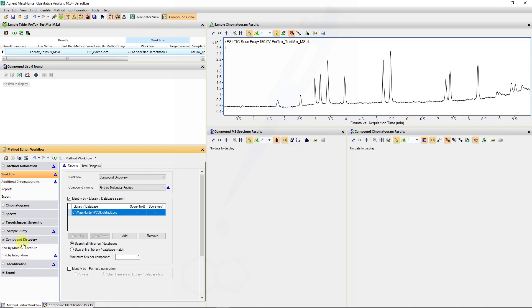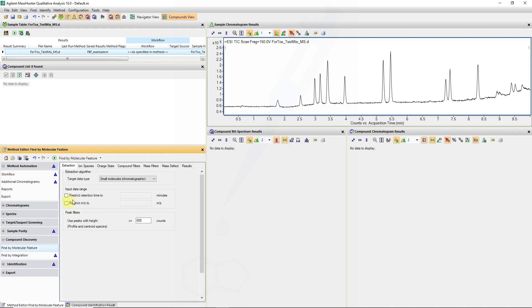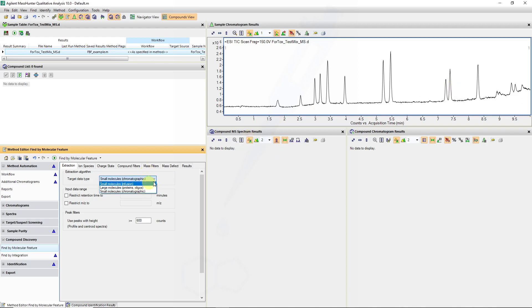The parameters for compound discovery will be found under the Find Biomolecular Features submenu item. In this case, we are going to focus on small molecules from chromatographic data, though it can also be applied to infusion type data and for large molecules. For now, we will keep the values at default, and I will show you some of the behaviors of these peak filters.